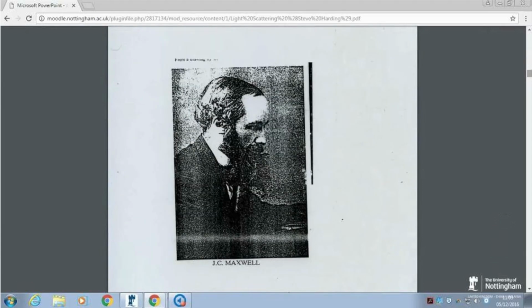Essentially, the phenomenon of light scattering was known for a long time, and it was Tyndall, the Tyndall effect. If it's a foggy, dank day and you're looking down the high street, and there's a bus coming towards you, not directly at you, but towards you, with its headlights full on, then you can see the light scatter in all the haze.